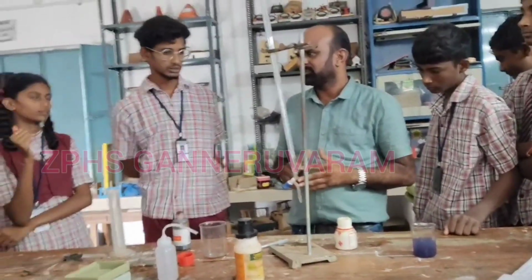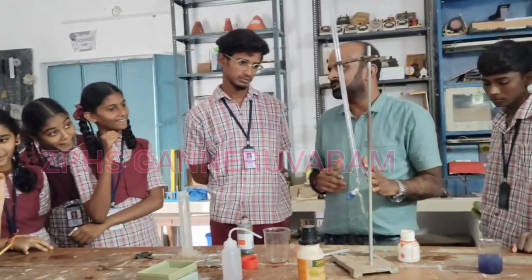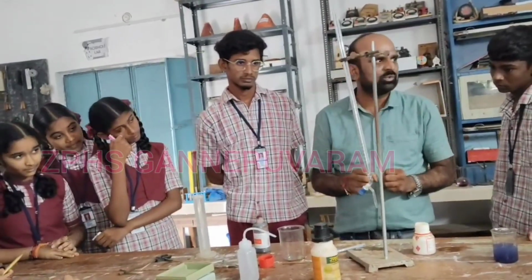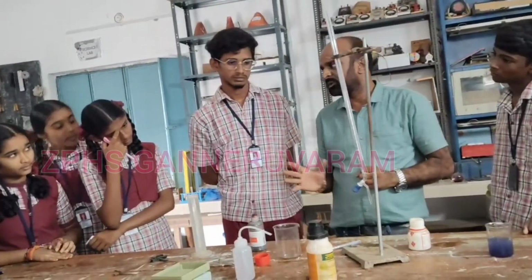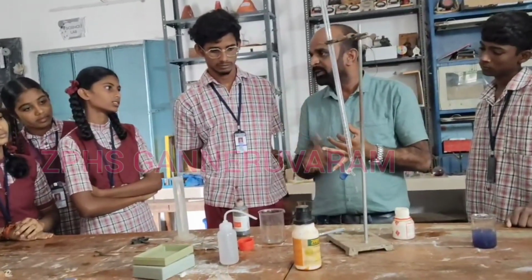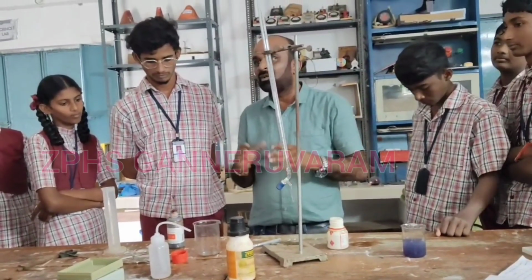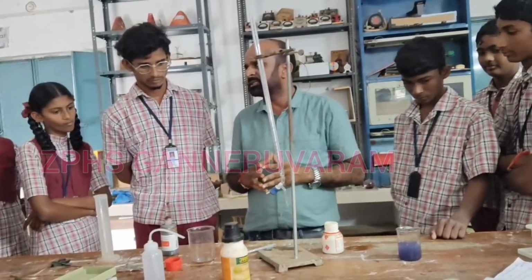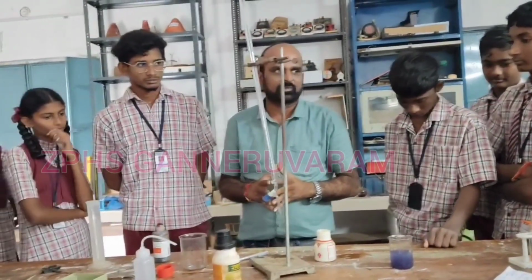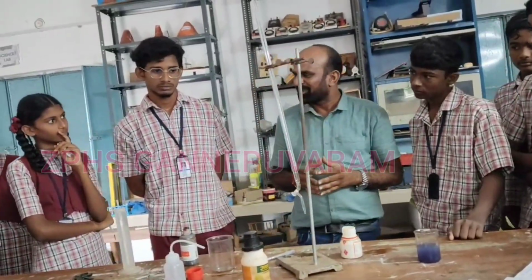Understood? In the neutralization reaction, the acid reacts with the base and gives rise to salt and water. The acidic property and the basic property will be gone. They lose the acidic property and basic property in the neutralization reaction. Thanks to all. Did you understand the experiment?